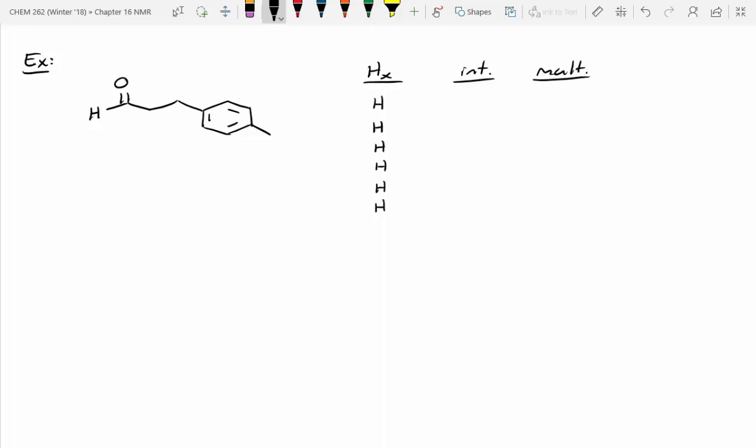All right, quick show of hands. How many unique protons? You guys getting 6? No? So let's go through and check. This is a good point to check. All right, so this one I'll call HA. How about these ones? I'd say they're unique, but equivalent to one another, so I'd say HB. And then over here, we've got HCs, 2 protons right there and there. What about this proton right there? That is a unique proton, but are there any others like it?